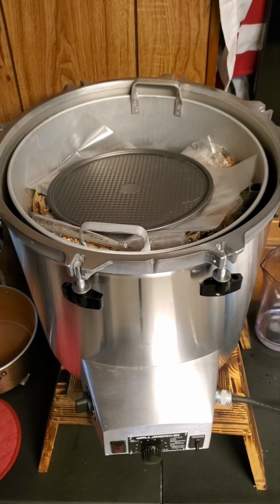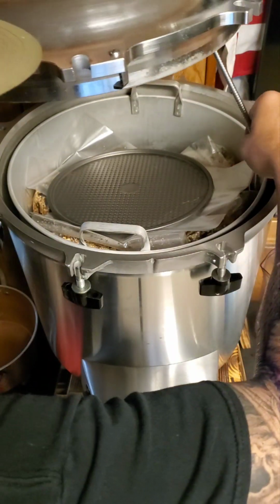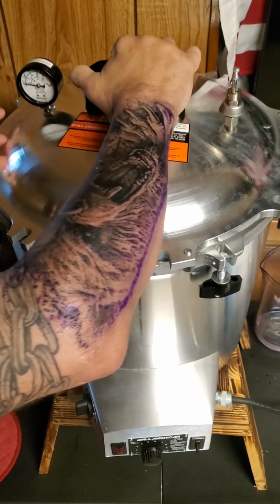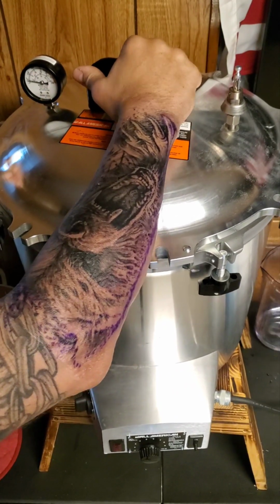valve protector on the side there so you can run your valve. But you see the water's already steaming, so this just helps it go faster. This is gonna let the air come out, so you're gonna blow it up. And put this bad boy on there. Pressure on it. Well, you turn it and boom.